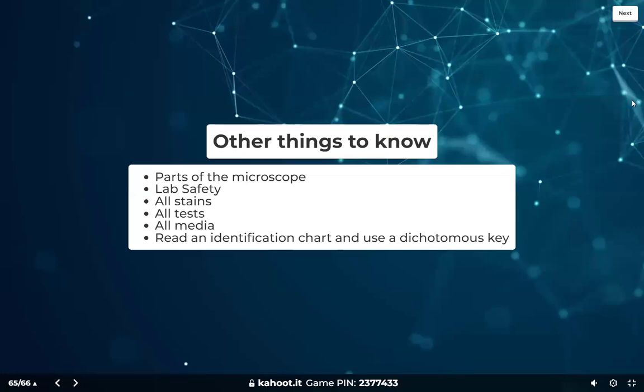I might also just give you a list of traits. It might say it is catalase positive, urease negative, phenylalanine positive. It made acid in glucose, but no gas. And then I'll give you a chart. You might not necessarily have it in the table, and you might not need to use all of the information that I gave you, but then find the organism name from that too. Okay, there's 2 questions for that. One is a gram positive and one is a gram negative. Cool.